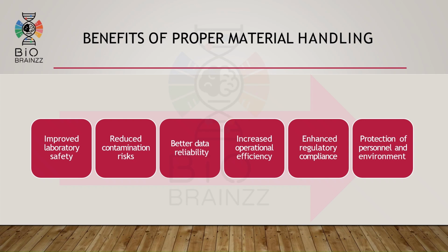Proper material handling provides many important benefits. It improves laboratory safety and reduces contamination risk. It also improves data reliability and increases operational efficiency. Most importantly, it helps laboratories maintain regulatory compliance while protecting personnel and the environment.